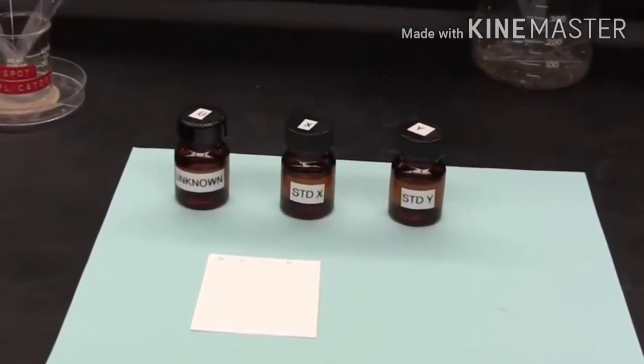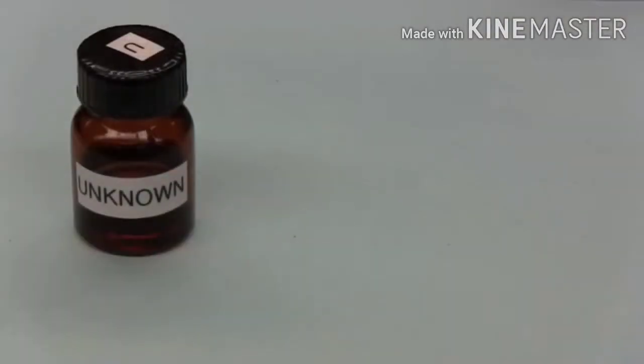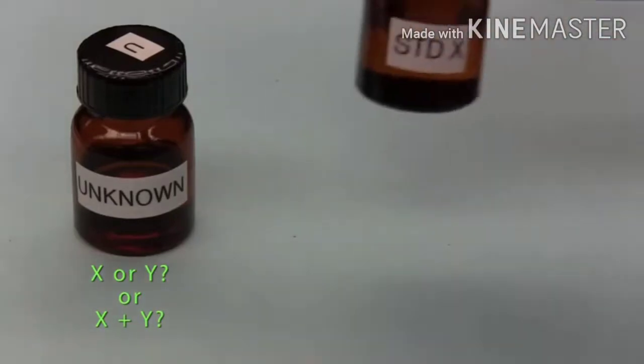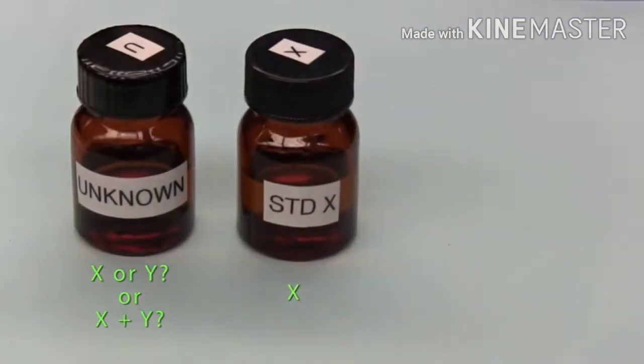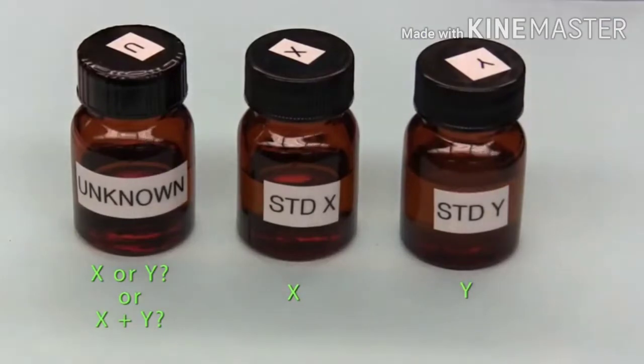In this demonstration, we are going to see how to separate and identify using TLC. In this bottle, the identity of the contents is unknown, but we do know that it contains either compound X or compound Y, or even a mixture of both. In this bottle, we have an authentic sample of compound X, a sample which we know beyond any doubt is compound X, so we call it standard X. This is our first reference. In this bottle, we have an authentic sample of compound Y, a sample which we know beyond any doubt is compound Y, so we call it standard Y. And this is our second reference.